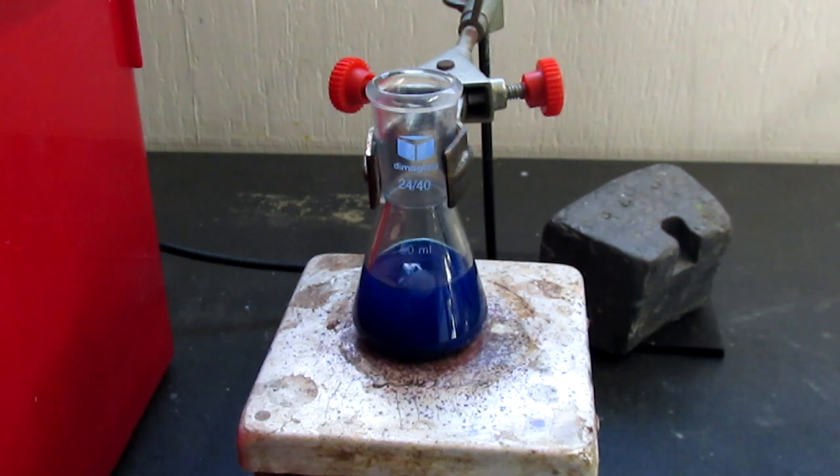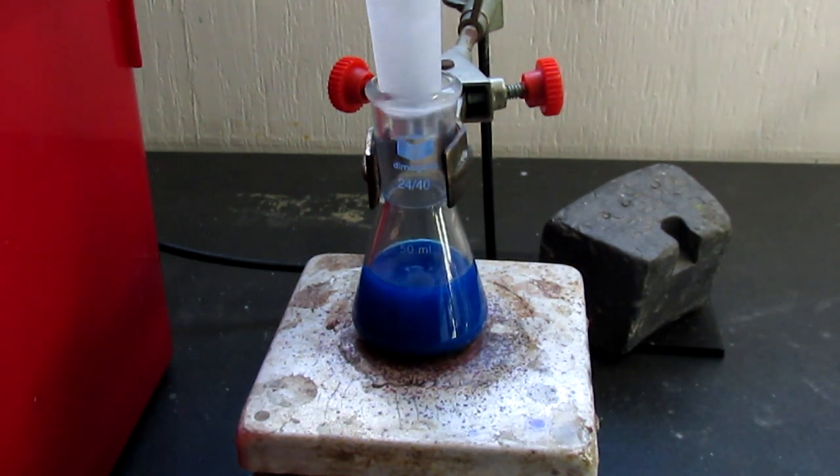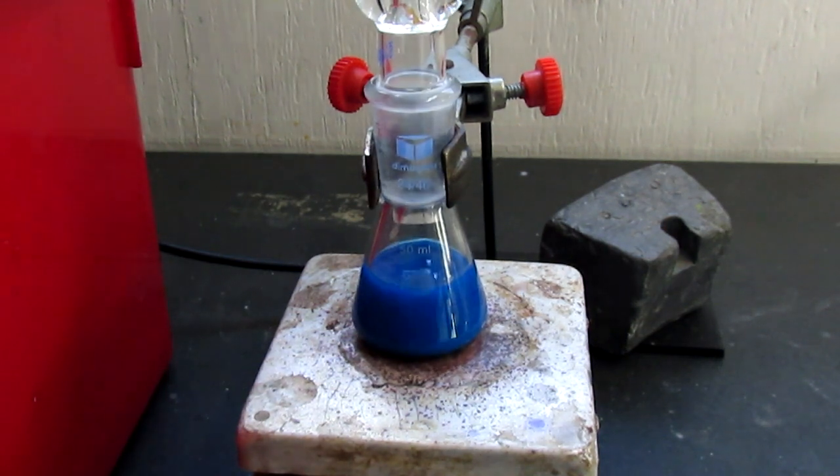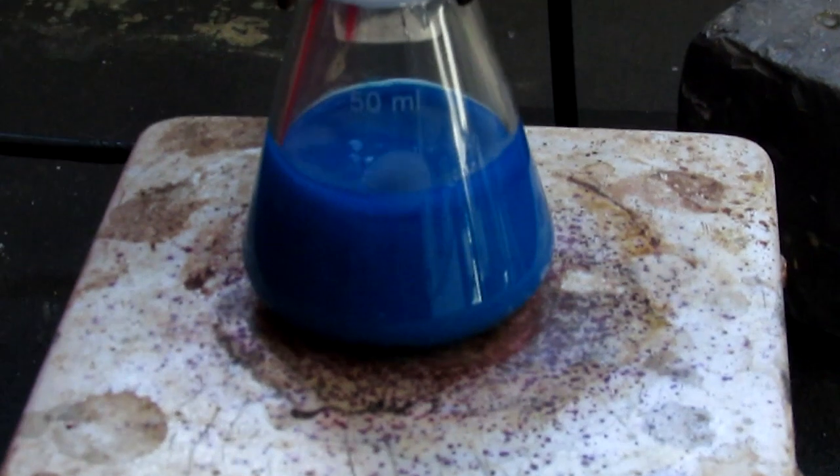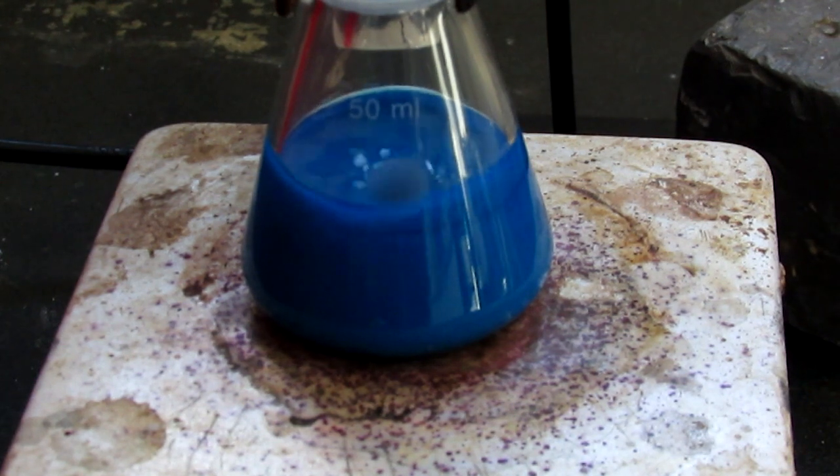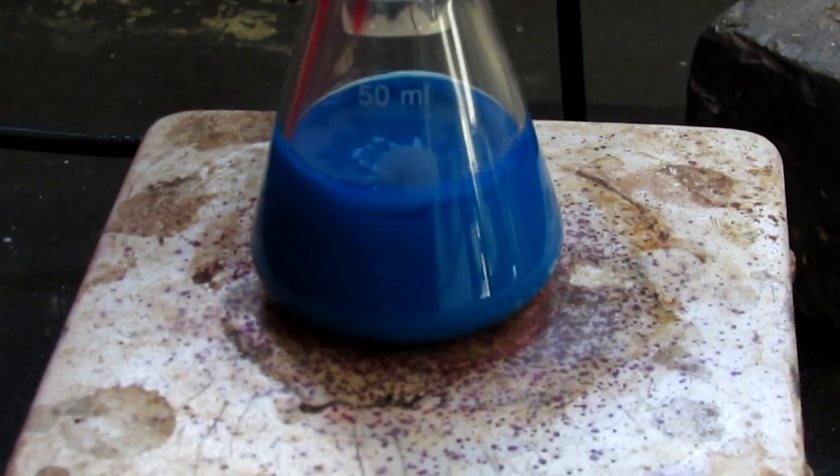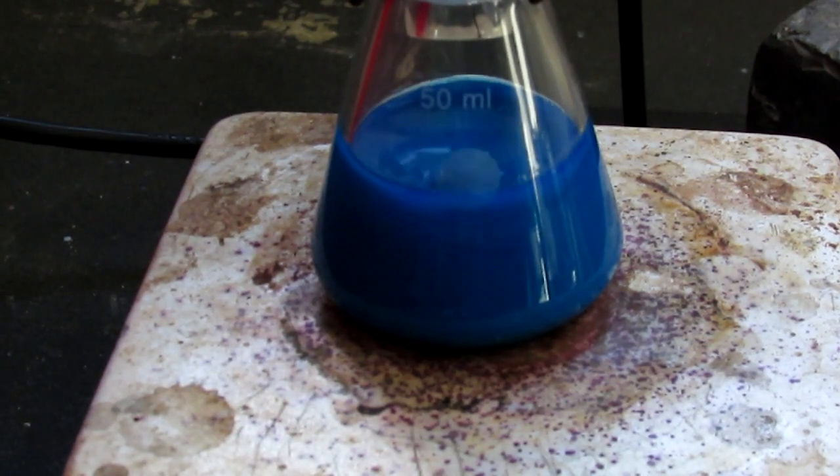Now we're going to stick the reflux condenser back on and continue refluxing for around 20 minutes. We may already be able to see some of the precipitate forming. Looks to be a nice blue color as expected.